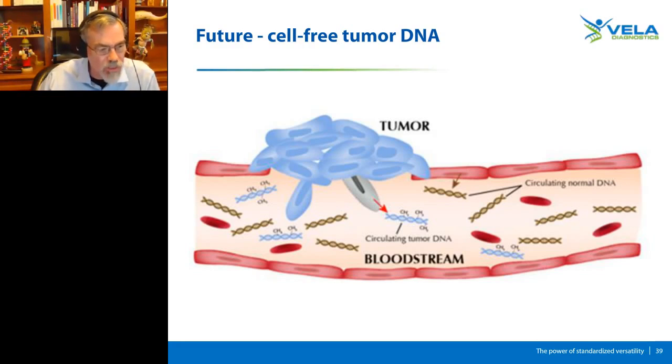There are some technologies, methods to actually lower the background or to actually amplify the biomarkers that are needed. It always helps if you know the biomarkers that you're looking for. In other words, if the person has a leukemia or a biomarker that is a signature for the disease, to be able to look for one or two variants rather than a whole slew of variants.